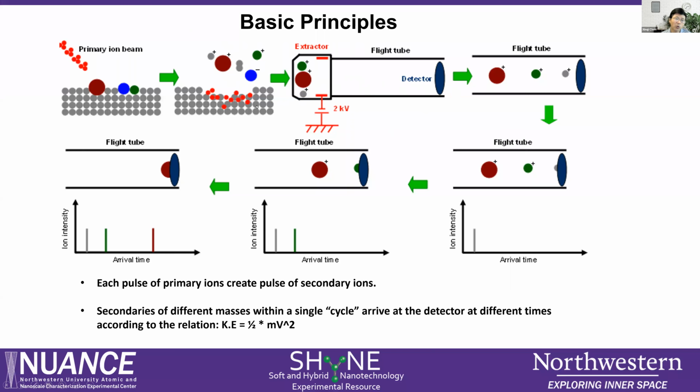For example, with a gold surface or platinum surface, even if you have a lot of platinum and gold, when you do this sputtering you will find the mass peaks for gold and platinum very, very low, because they are inert, noble metals. They are not easily ionized. They are just neutral and pumped away.